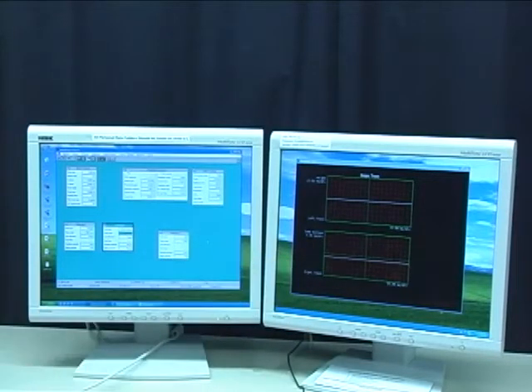This is the current signal coming from the conducting tip module. And since we have no bias applied across the resistor this current should be zero. So we'll adjust the current offset in the amplifier using a screwdriver and the potentiometer in there.